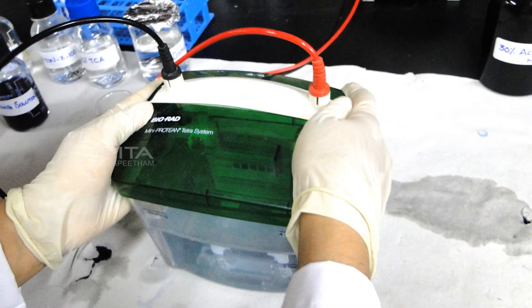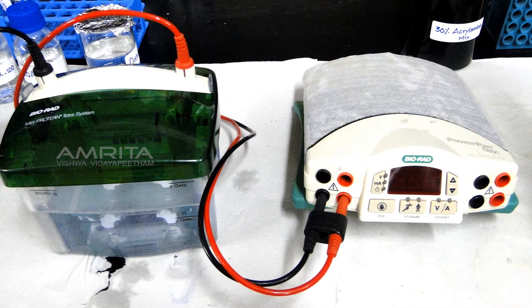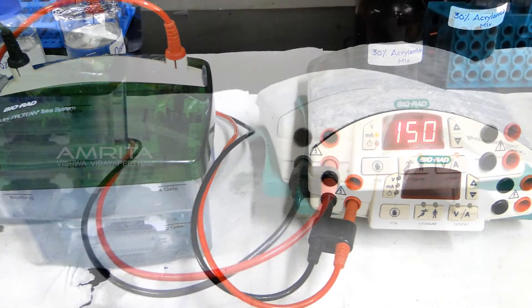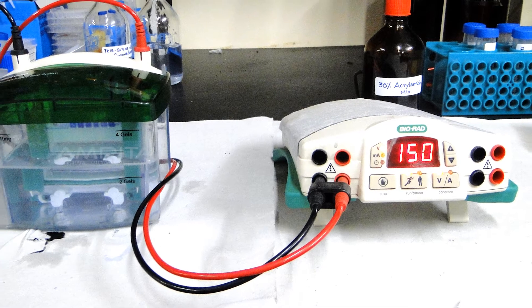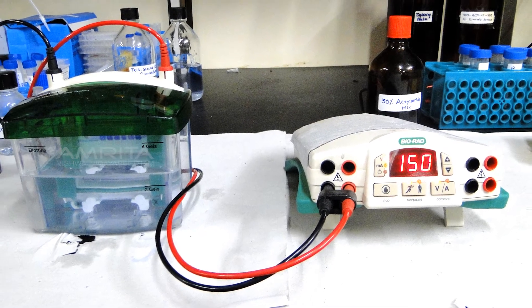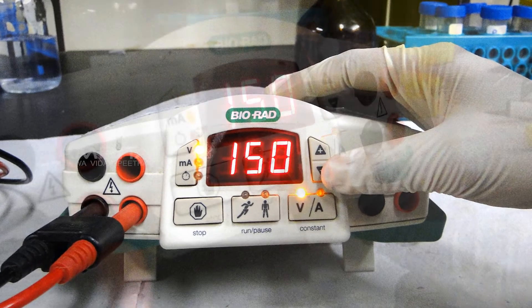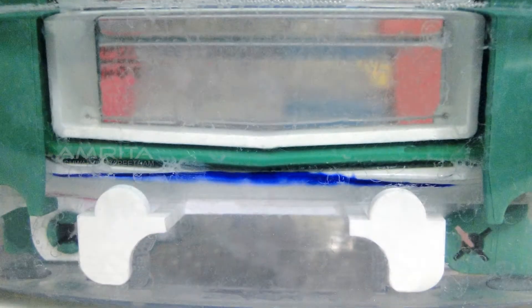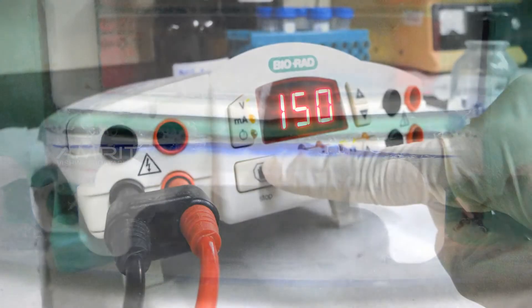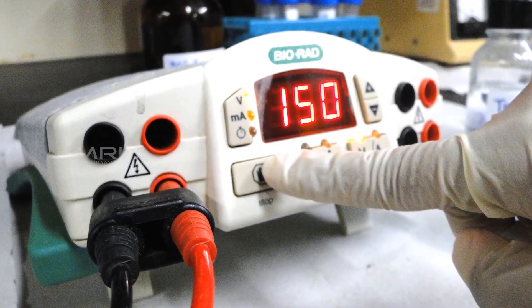Close the lid of the gel tank and connect the wires to electrical circuit. Make sure the connection is proper, i.e., black lead to black and red lead to red. Now set the voltage at 150 volts and run for about 1 hour or until the dye front runs to the end of the gel. Now switch off the power supply and disconnect the electrical leads.